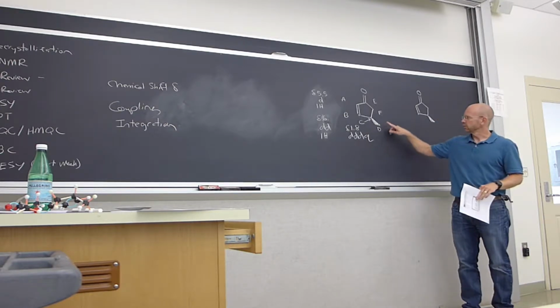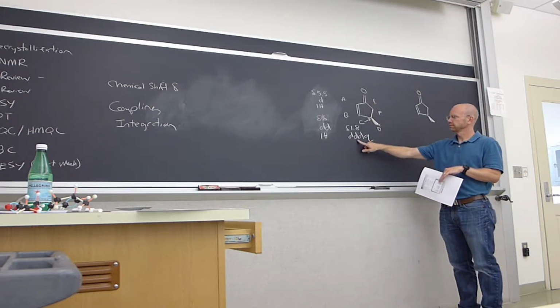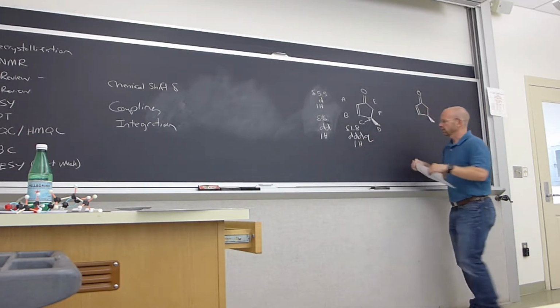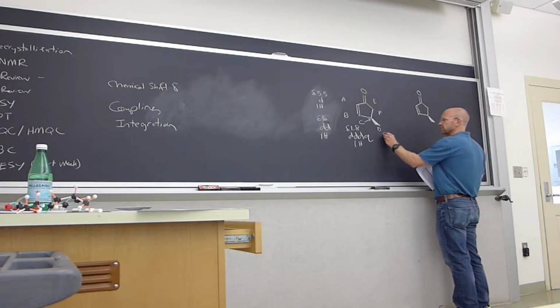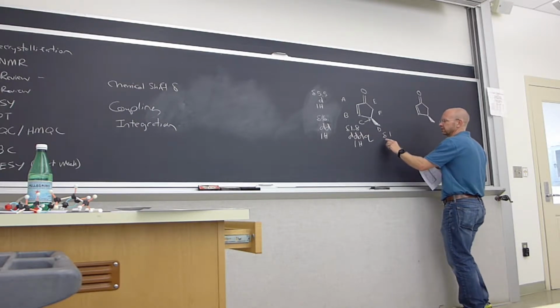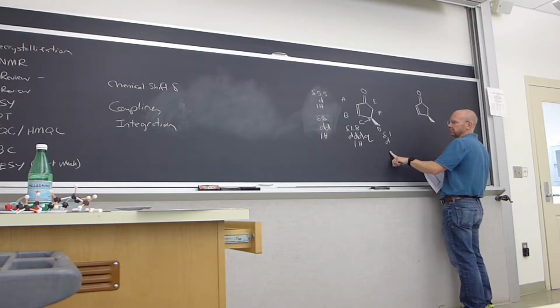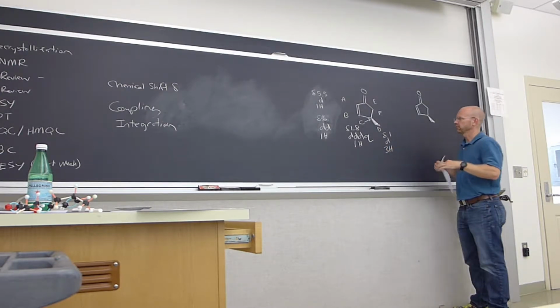Okay. So how about group? Oh, integration. 1C. Yeah, or 1 hydrogen. Okay. And how about group D? What do you think? Chemical shift? 1. Around 1. That's a fine guess. And then multiplicity? Doublet. Just a doublet. And then integration? 3. Okay. That seems to make sense.